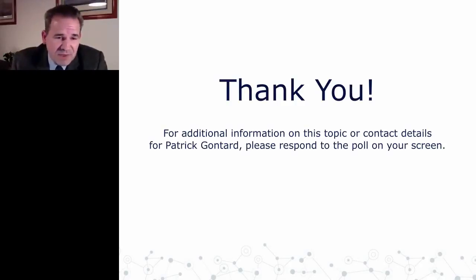And most of the time, to change informatics or to improve informatics, you need to improve the philosophy of the production, the philosophy of the catalog. Do you have a unified catalog? Do you have a unified production system? Then, once you have these two elements, you can have a unified informatics. But we quantify, for example, validation versus auto-validation. We quantify sites that have middleware versus no middleware.